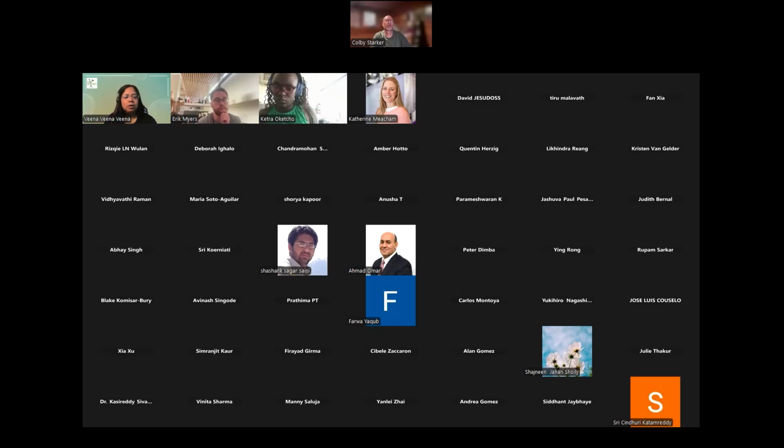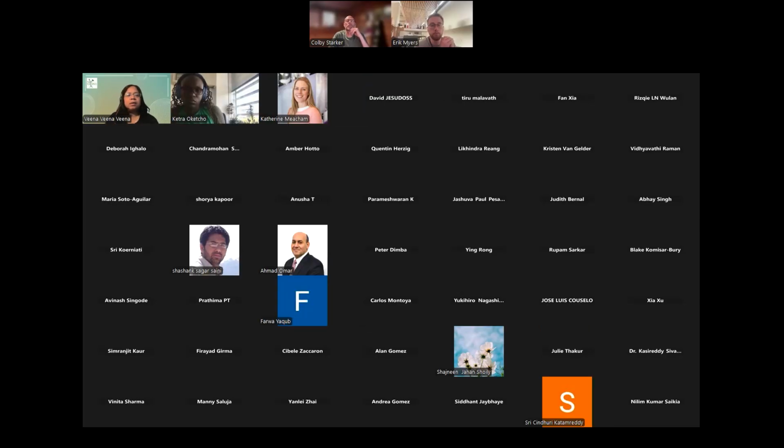Vina, you're muted. Question is from Sri Kurniati: how many nucleotides of distance between two guide RNAs to make both work? What would be the optimal recommendation or the range you could recommend? Erik, can you do this one? I think you've done the most on this. Sure. I usually set the minimum distance between both guides as the size easiest to see when you run your DNA band on a gel.